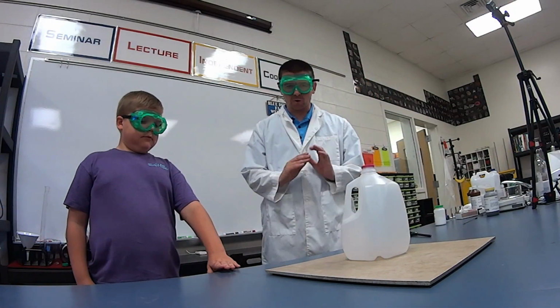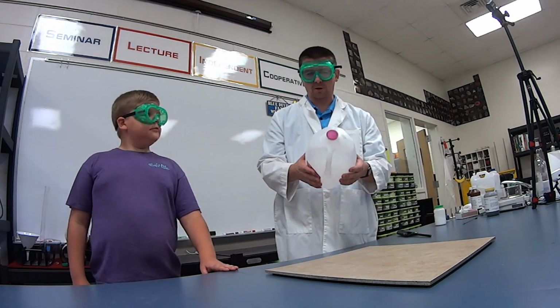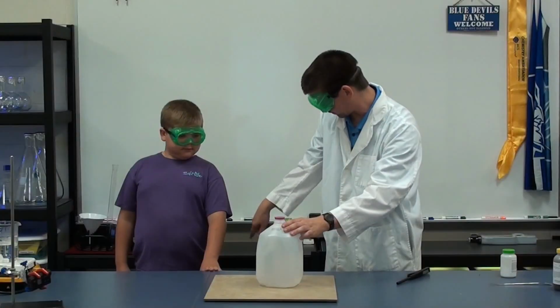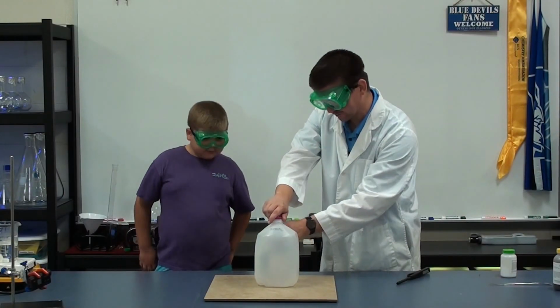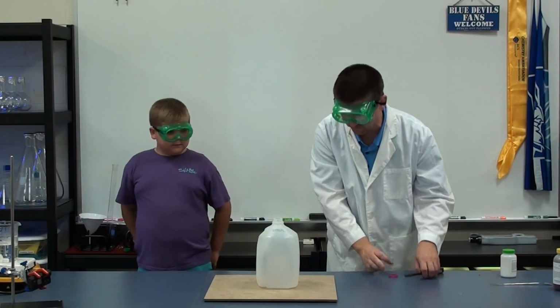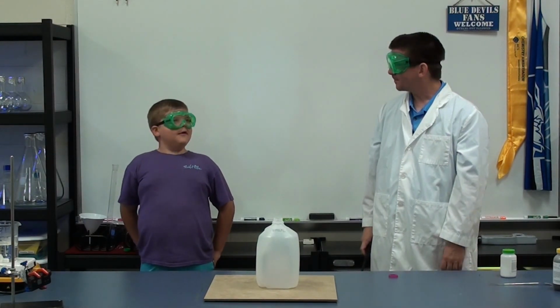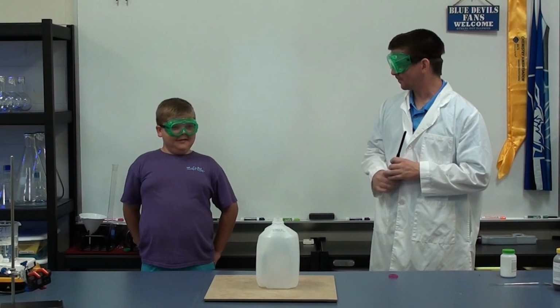All right, so we saw our partial combustion. Now we're ready to see our complete combustion. We've got our alcohol vapor in here. I'll have you just take a step back. You don't have to move too far, but I'm just going to pull this off. We're going to step back. We're going to light it. Oh. And there goes the alcohol.